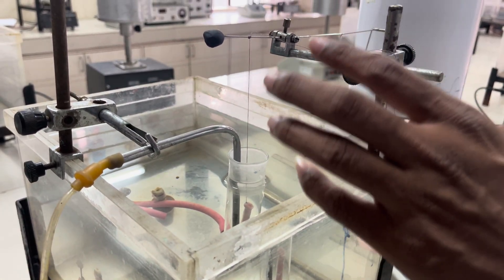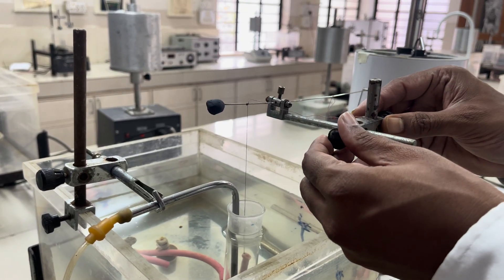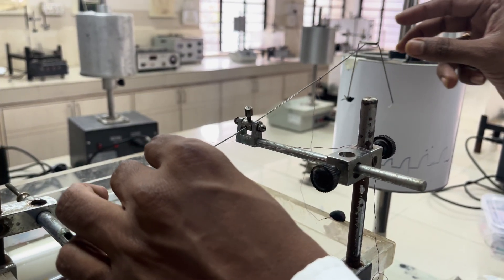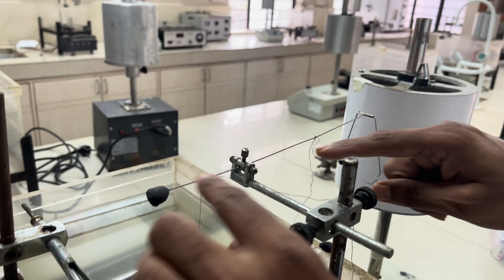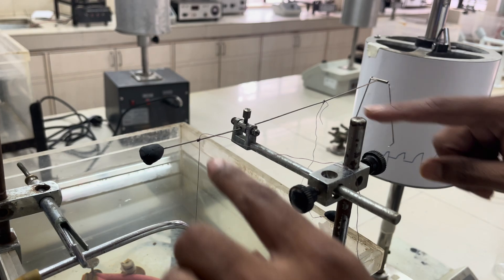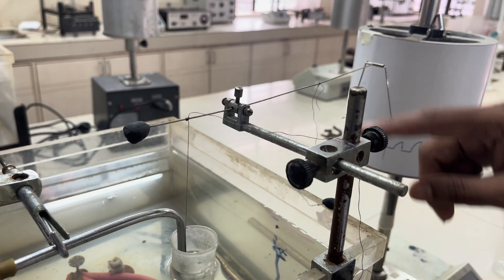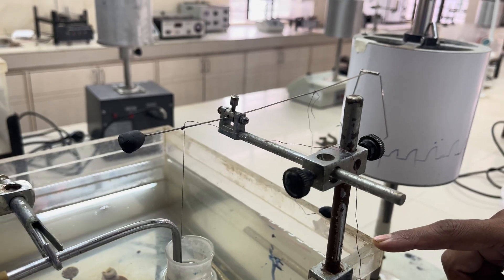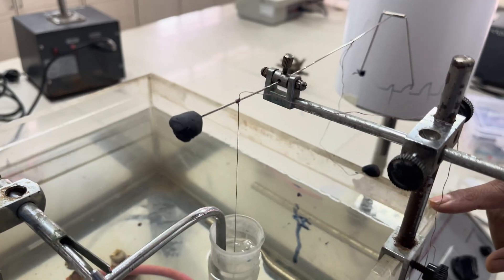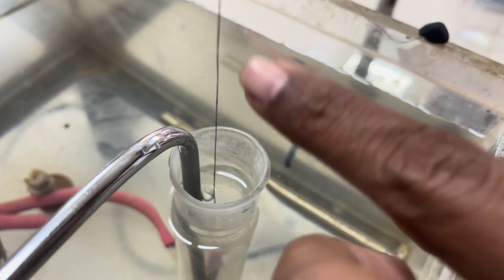An important part of this experiment is the fulcrum — the lever is attached here. The lever is balanced using wax so that it remains horizontal. The distance is set based on the magnification value.